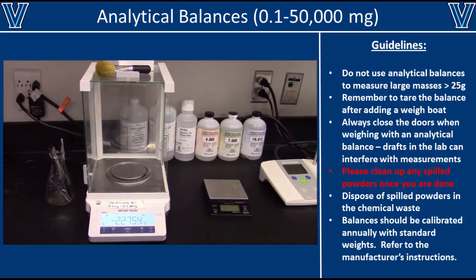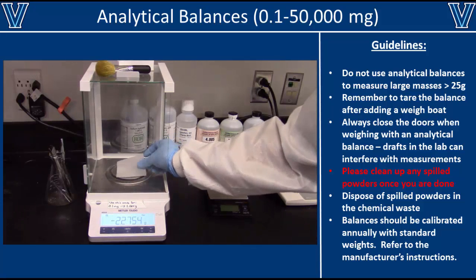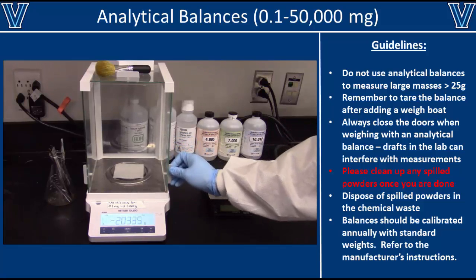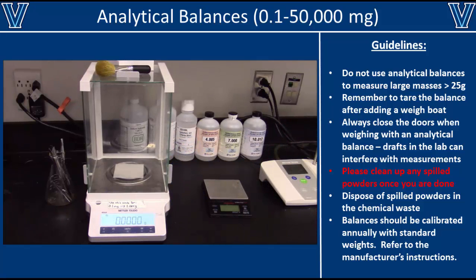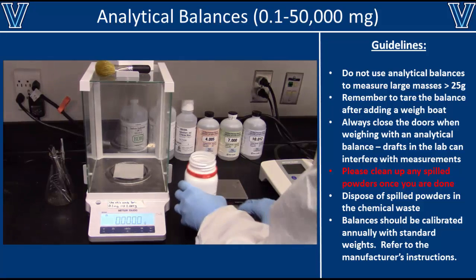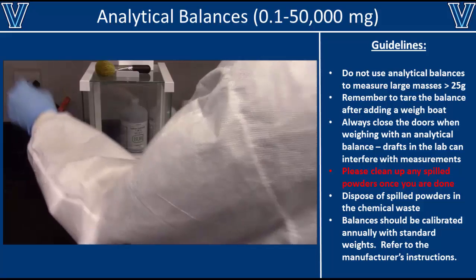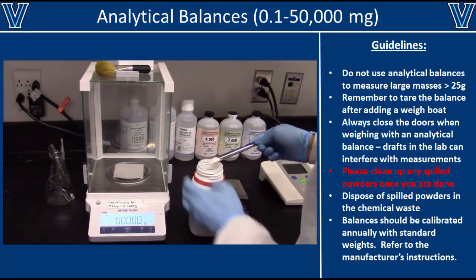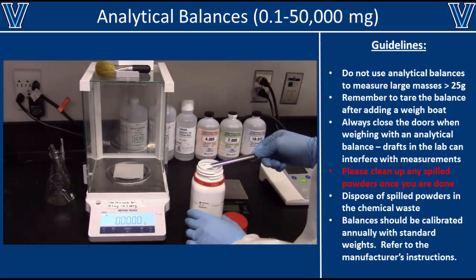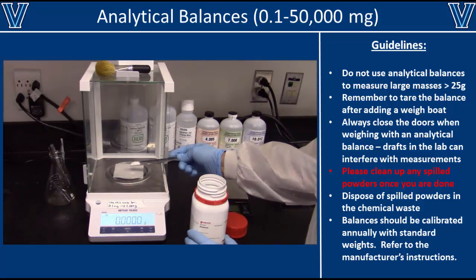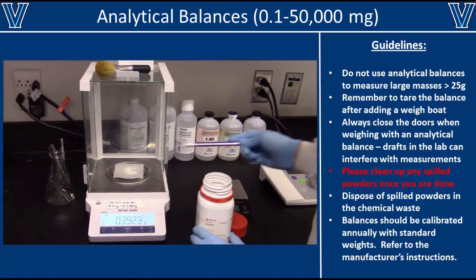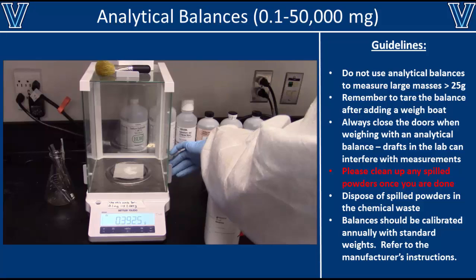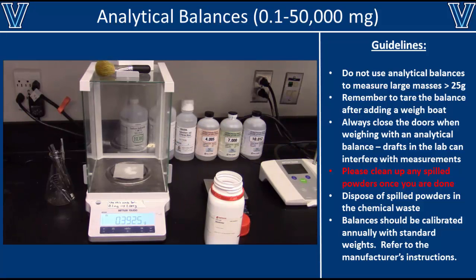To weigh masses smaller than a gram, use a weighing paper. Weighing papers are preferred because they cling less to small powders and crystals. Transfer your chemical to the weigh paper using a clean spatula or scoopula, as shown here. Slowly add the chemical to the weigh paper to prevent going over the desired weight. Check the exact weight by closing the doors on the analytical balance and giving it a few seconds to stabilize.